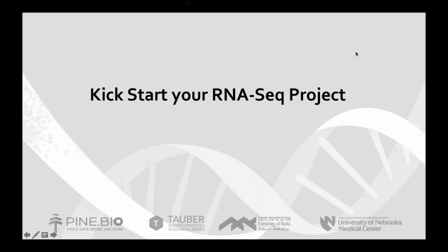Okay, so let us start. We are now going to be doing our webinar on how to kickstart your project, your RNA-seq project. We're going to be relying on the T-BioInfo platform, and I want to just mention here in a few words a little bit of an introduction.